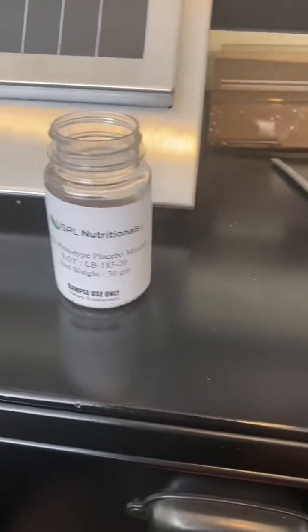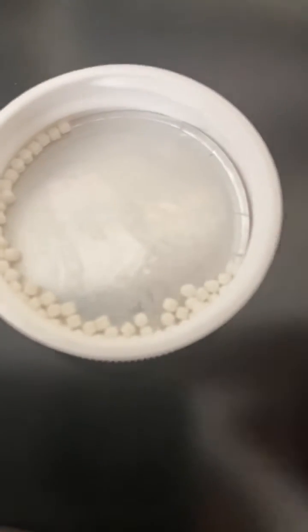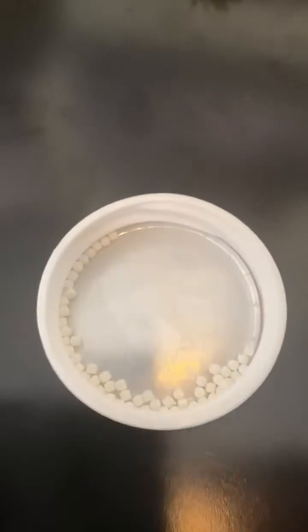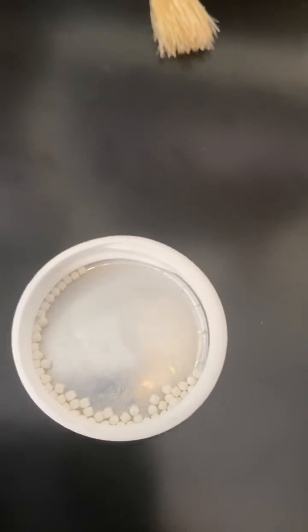The load cell is based here and we are testing today these mini tablets from USPL Nutritionals. These tablets are very small round tablets, about 2 millimeters in diameter and about 2 millimeters thick.